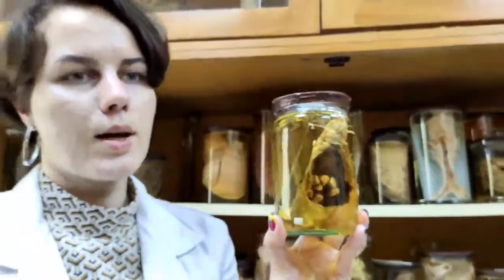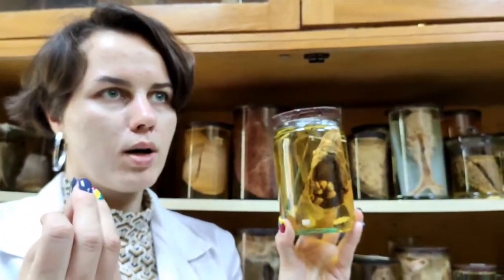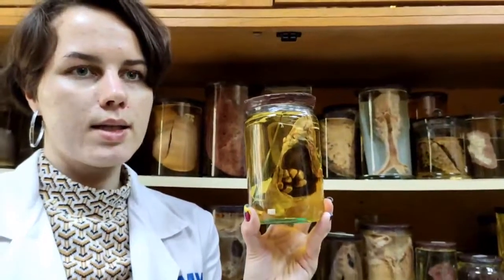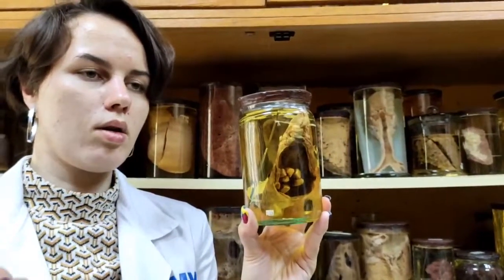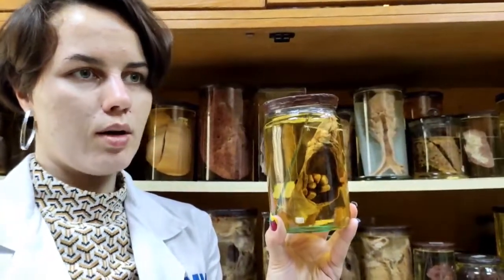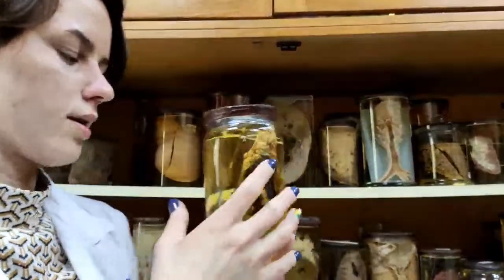When there are really firm accumulations of calcium, for example, in connective tissue in the body, these are not stones. Stones are only these bodies which can be removed from the organs.